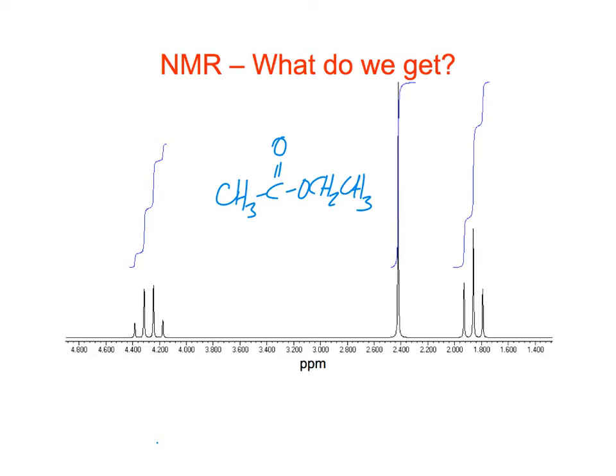Okay, so back to the question. What parts of this spectrum can we gather information from? Are you asking in terms of without knowing splitting or integration? Well, splitting is one thing that we can get information from. Integration, relative peak heights usually. Well, it's not so much the peak height, but it's the integration. It's the area under the peak, because the peak height can change for an equal integration, just depending on whether it's sharp or whether it's broad. Shifts. Yep, and then chemical shifts.